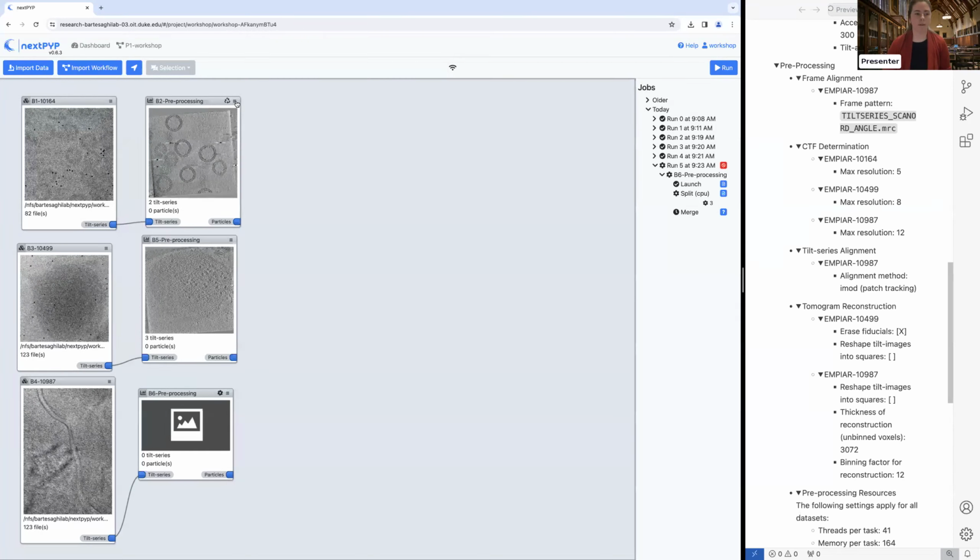So we do that. Are there any other line features we should cover? Okay. There's a couple other useful ones in here. So again, these are just the 3 lines on the very corner of the block. And one that we find very useful is this navigate to latest logs. So if you click that, it'll open whatever the latest log is here.